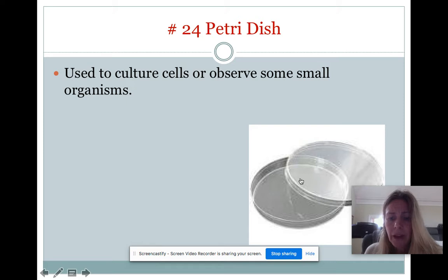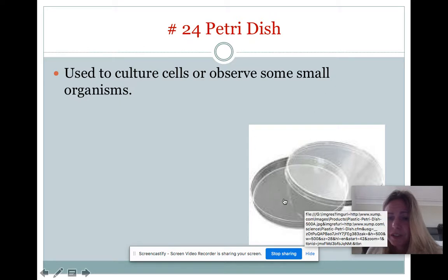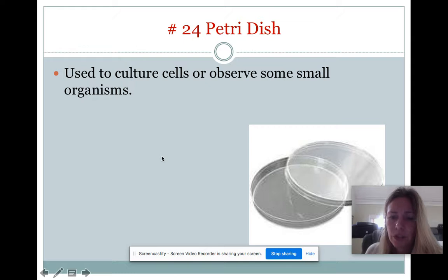and they do that horrible swab that goes in the back of your mouth, and then they swab it on this broth. It almost looks like yellow Jello. Then when it grows, they see what's growing inside your mouth or what the infection is, and they can give you the right antibiotic to help cure you. Because if you give the wrong antibiotic, it's not going to do anything. They want to know the species of bacteria that's growing on you, so they grow it in this type of plate. Again, it's got Jello on it, or blood, depending on the type of bacteria.